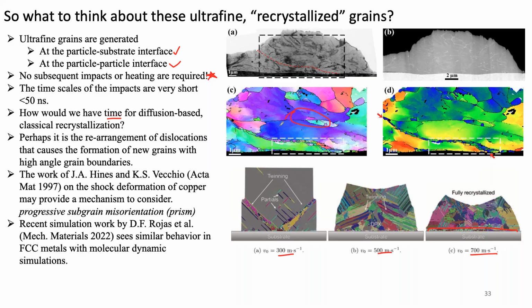Are there any effects from the thermal gradient between the region heated with the laser and the rest of the material? Yes. So I can melt my substrate with the laser that I have. It's a 4 kilowatt laser, and depending upon how much power and the spot size, we can melt things, which we don't want to do.